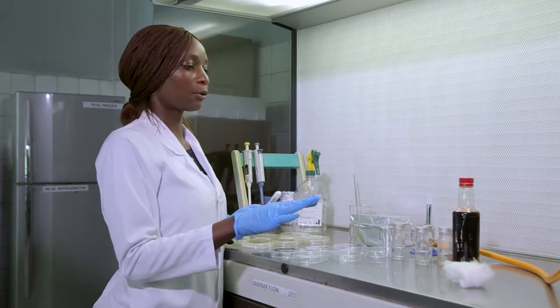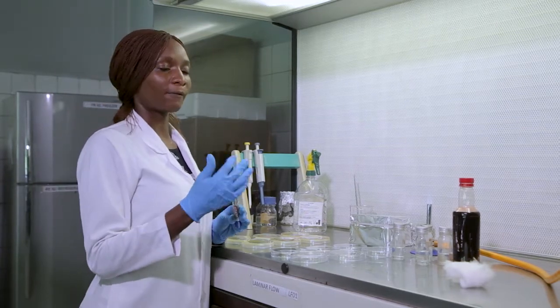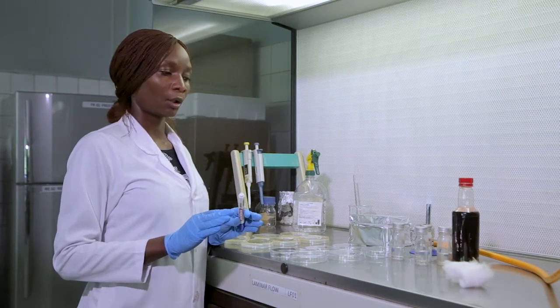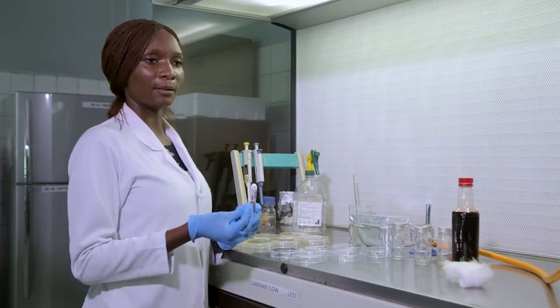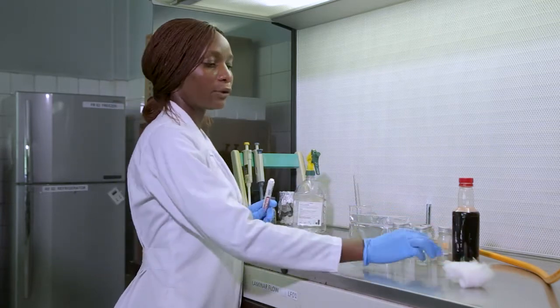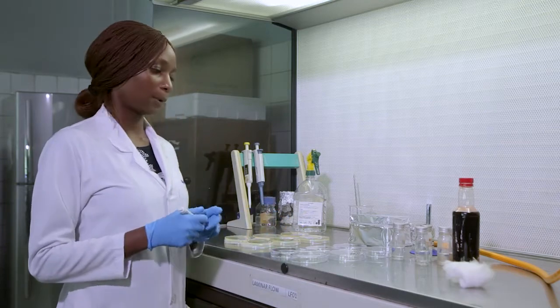Okay, the dilutions that we use do not really matter in terms of the final concentration of microorganisms. They'll still give you the same log value, but it's how easy it will be for you to count the microorganisms. If there are very many in the sample and you use the low dilutions, you'll have a lot of growth on your plate and you'll not be able to count.